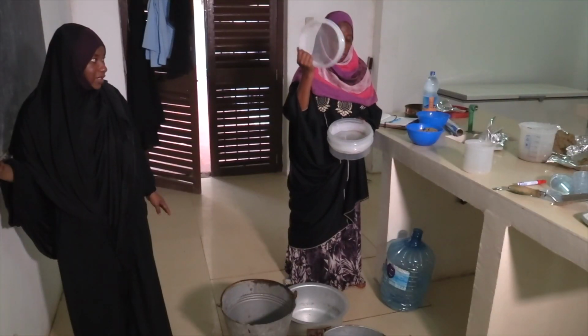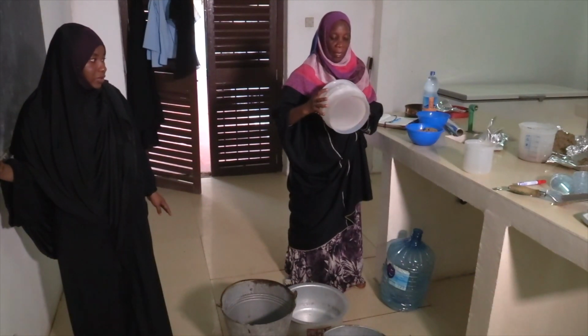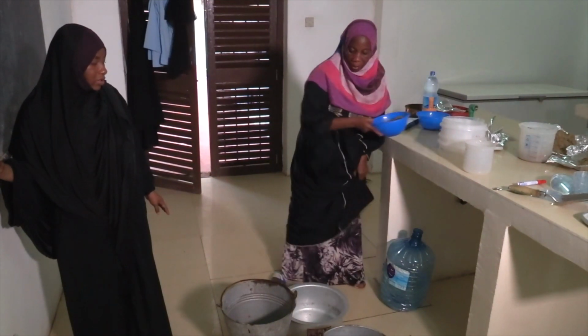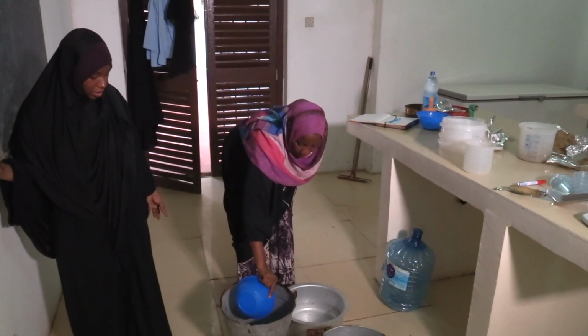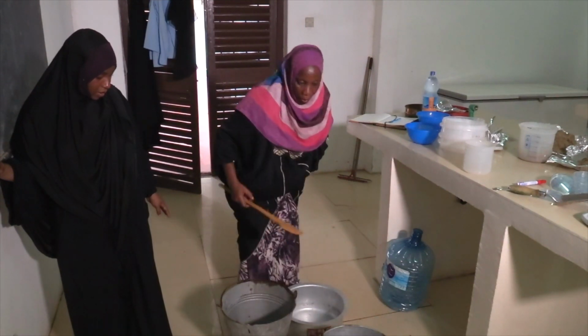The 1 millimeter sieve should be at the top, and the 0.3 should be at the bottom, like this one. We take it here, and then we put our sample here. Now we start the separation for the microplastic. So we stir it for about 5 minutes.